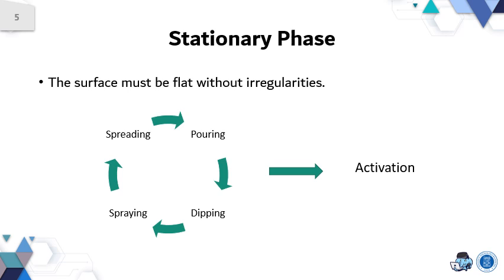At present, it's really easy to find the stationary phase. You can just buy it, like a TLC plate with alumina on a backboard. So it's not necessary to make it by yourself.